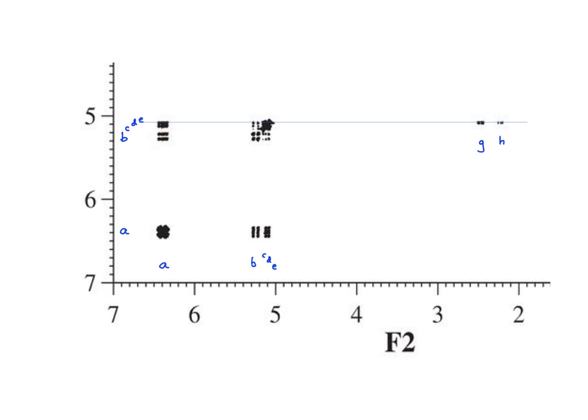From this correlation, we can see that A is correlated with B and with D, although D does overlap with E, so we need to keep that in mind.